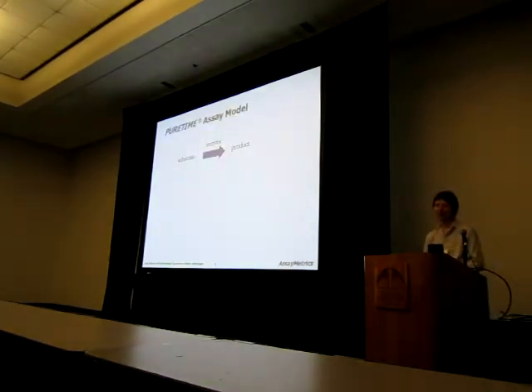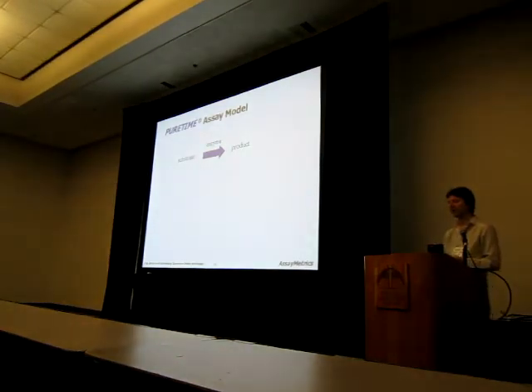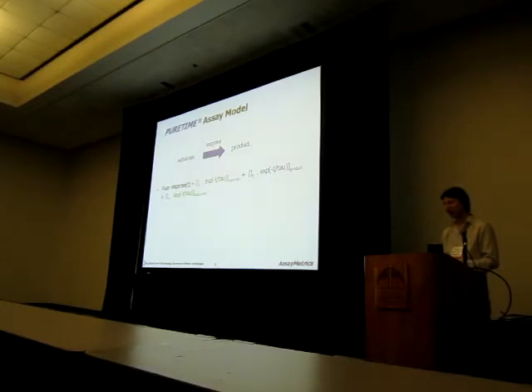Okay, so almost through the introduction. Let me just explain a little bit about how you do a fluorescence lifetime assay. Let's take one step backwards and talk about the assay model that we're going to use. All of you, I guess, will be really familiar with this model where you take a fluorogenic substrate, which is acted upon by an enzyme and is turned into a product. The product and the substrate have different fluorescence characteristics. So this is the basis for all FRET assays.